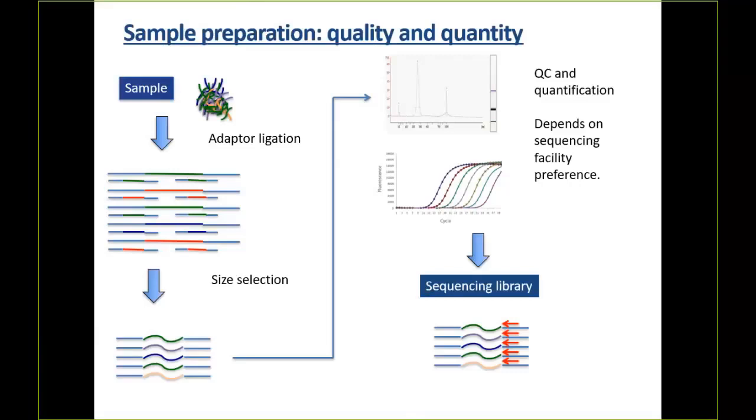So for example, if you're doing nanopore, basically nanopore is trying to pull a single strand of DNA through a very, very small pore in a membrane. But in order to get it started through that pore, you need something that's basically going to start pulling it through. So you need to do some library prep there. I'm actually not super familiar with nanopore library prep. I'm much more familiar with Illumina. But with Illumina library prep, the idea is still very similar.